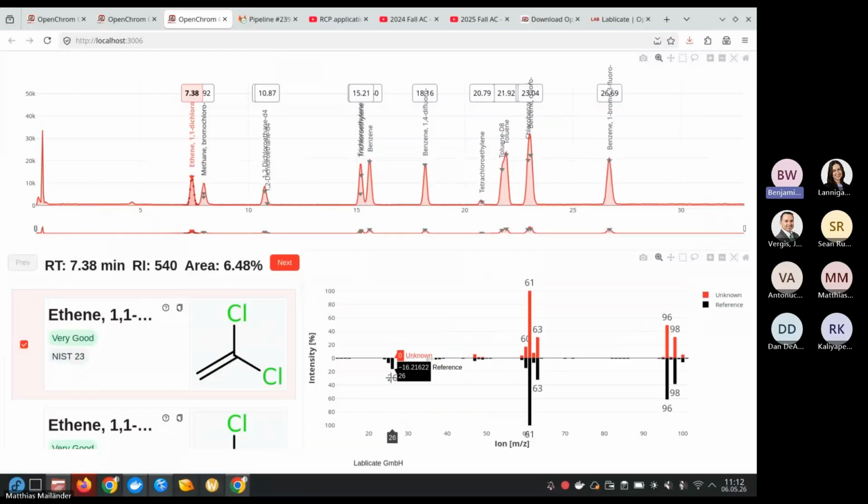The comparison spectrum. I need to query the database for the comparison spectrum to display that. So that's, again, another Allotrope simple model object that gets queried, and we get there. So that's basically one thing. What I also noticed, this is also a pretty interface. We showed this at a trade show. It looks good on a large screen.